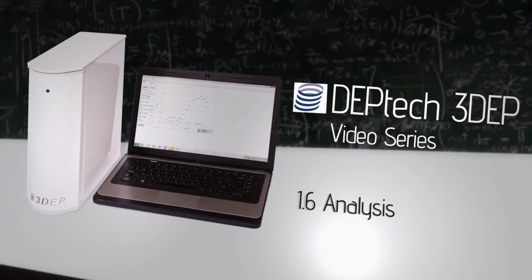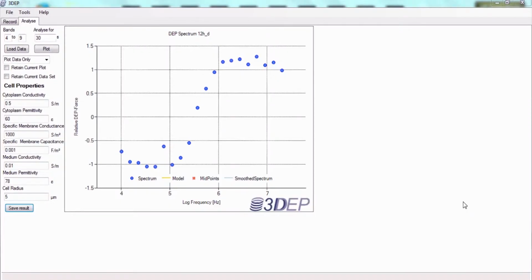Once the 3DEP reader has finished its analysis, you'll notice that the Analyze tab pops up with the spectra that it produces. This automatically gets saved as an Excel file, an XML file, and an image file of your graph. So you don't have to do anything with this data right away. You can wait until you're done with all of your analysis and then come back and analyze your data later.